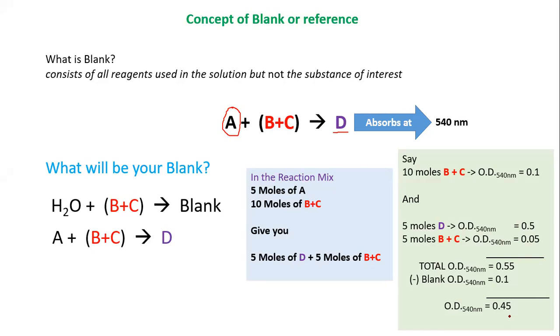No, sir. So what's the problem? What is the problem you are sensing now? The blank should be kept 0 always. No, you will adjust blank 0. You adjust blank 0, correct? It gives you some absorbance, right? And you make it 0, correct?